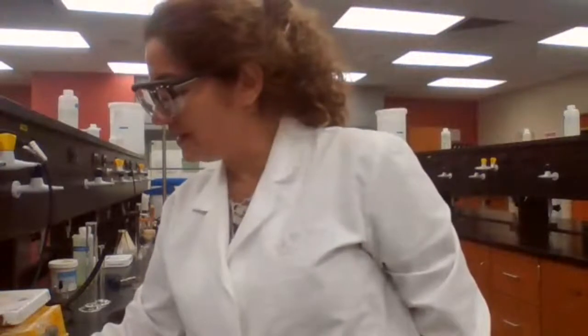Isn't acetanilide the crude product? Even if it is the crude product when it's still mixed with the solvent and leftover reactant, after you crystallize it, it's going to be pure acetanilide. So we are looking for the melting point of acetanilide actually. So do you have the melting point? 113 to 114, good. So if it's 113 to 114, we cannot have the setting for the oven too high. So it has to stay around 100.